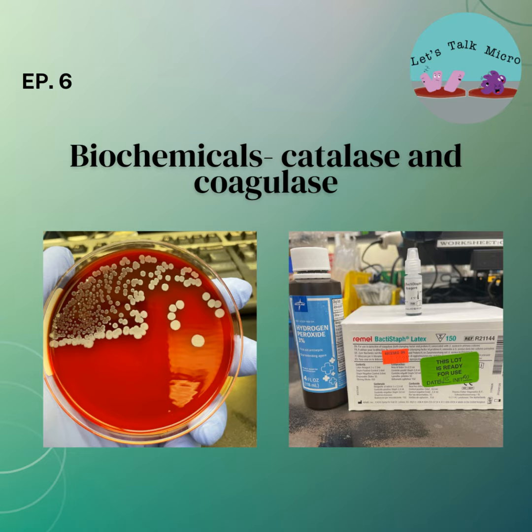You can also appreciate that when you put it on motility agar, you see the nice shape of the umbrella. You stab the agar, you get a colony, and then with the needle you stab it, go down, then bring it up, staying in the same line of inoculation. Normally, if the bacteria grows outside that line, it's motile. And in the case of Listeria, you see the shape of an umbrella.